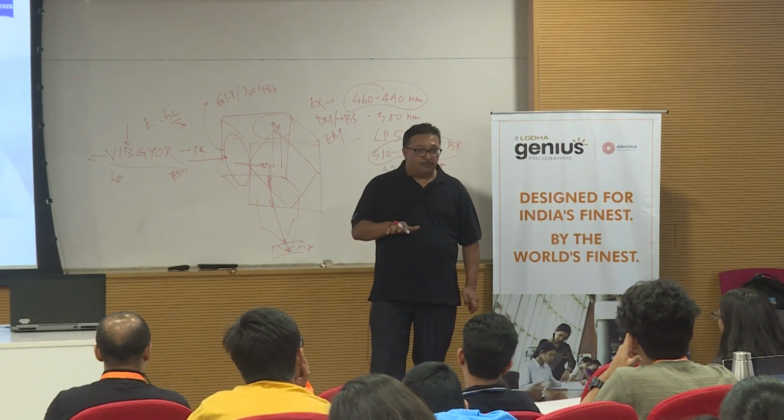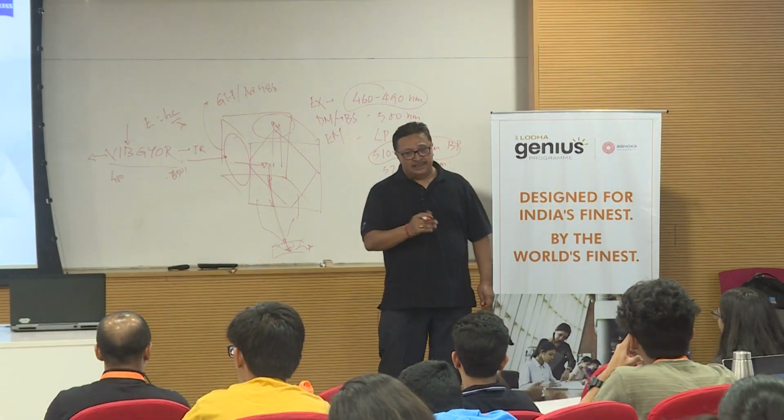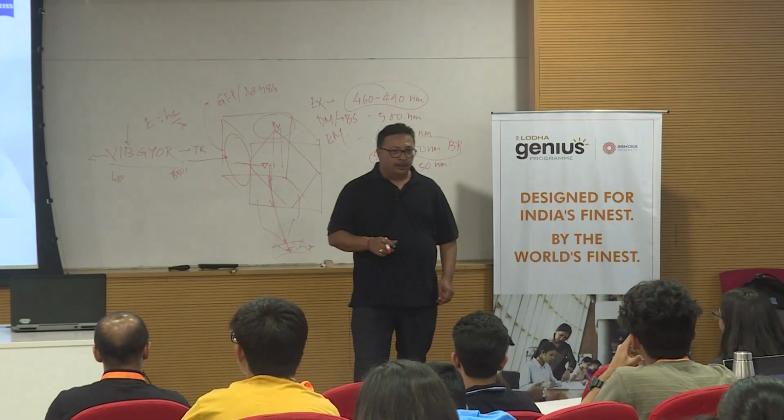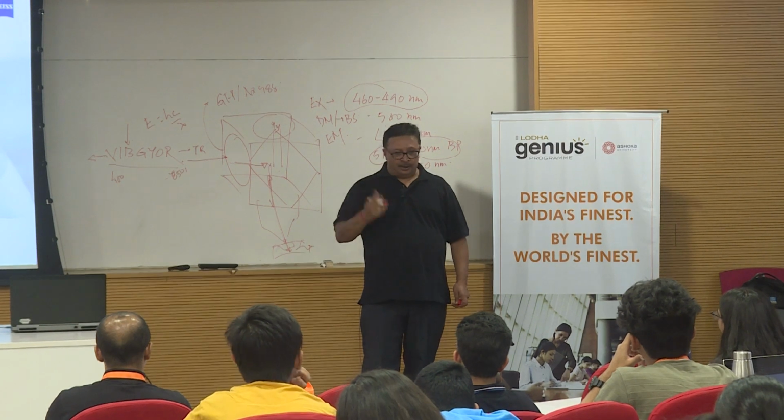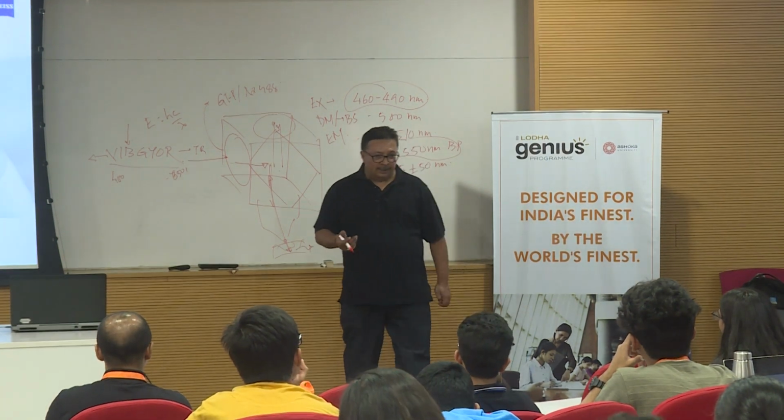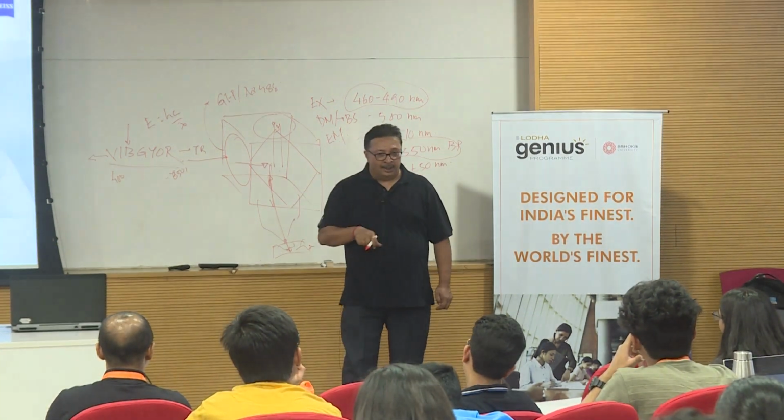When you have a monochrome camera, which is slightly more sensitive as compared to a color camera, you will give a pseudo color, and that pseudo color is your choice. Okay, I have visualized green, so why should I give green? I will give a yellow color. I will give a magenta color.